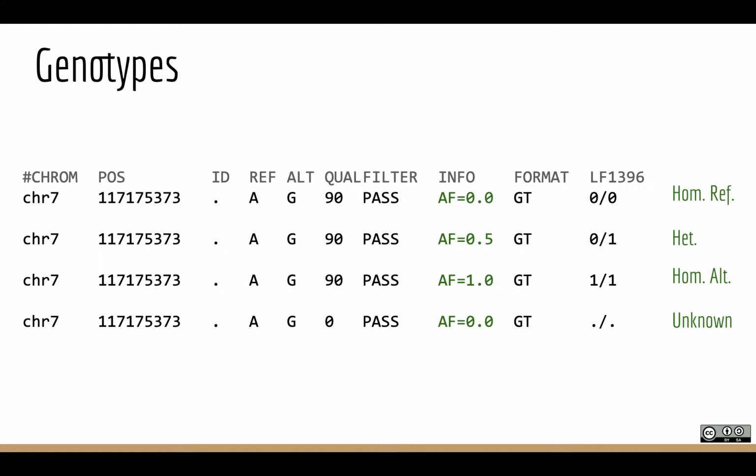All right? And if we sequence a genome to, yeah, do you have a question? Yeah, I was going to say, is that contingent on the filters that you use? It is. You could, for instance, set a filter that says, I don't want to look at any variant where any individual has less than 5 sequencing reads.